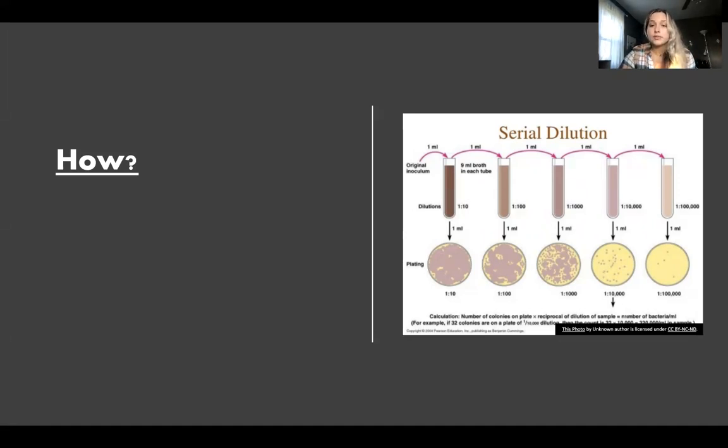This is a great image showing how a serial dilution is done, and you can see on the next plate that bacteria are already visible. It's very satisfying and rewarding to see progress that quickly, especially as a first-time student having never done this experiment before. It's very rewarding to make progress that early on.